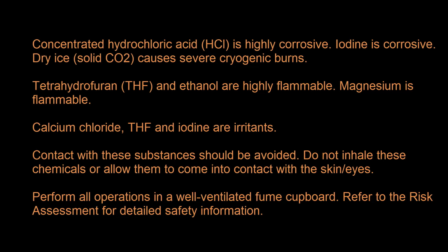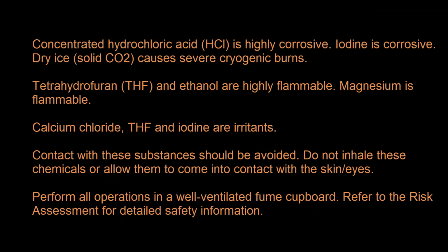Tetrahydrofuran, the THF, and ethanol are highly flammable. Magnesium is flammable. We know we come from group 2, the alkaline earth elements. They are used as fireworks, of course they're flammable. And calcium chloride, THF, iodine, all these are irritants. So contact with these substances without gloves should be avoided.